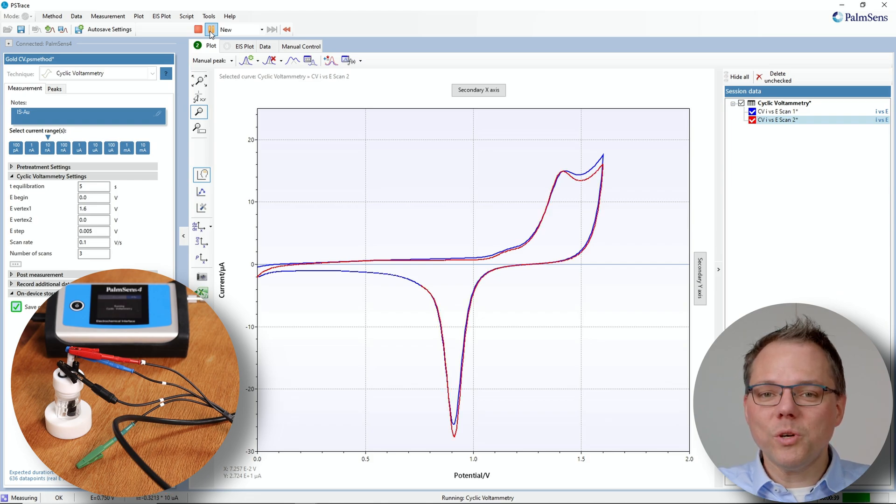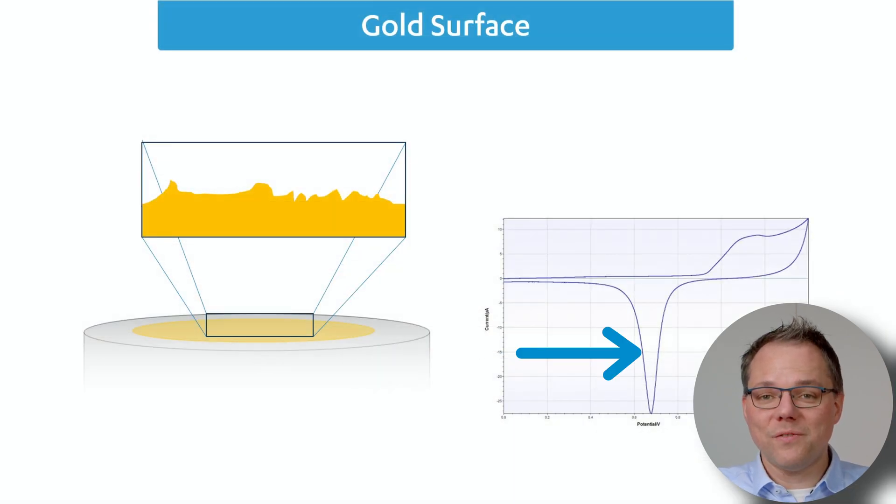Nice property of gold. Then we're going to more negative potentials. Again the gold gets reduced. We get this very sharp reduction peak that you see here in the CV.